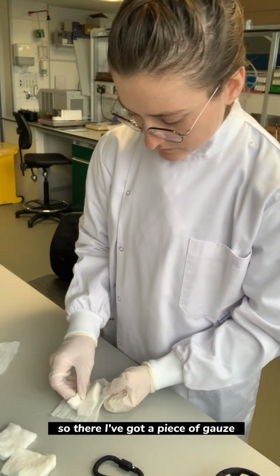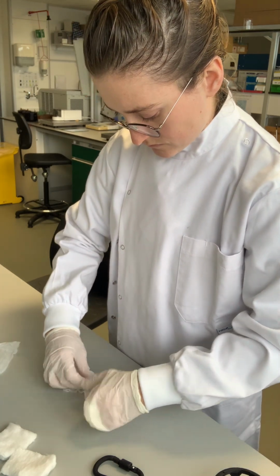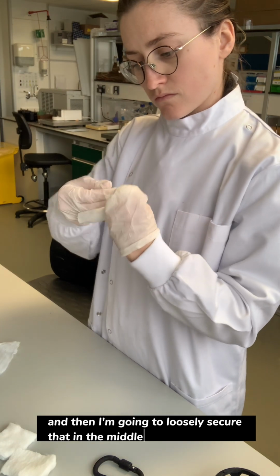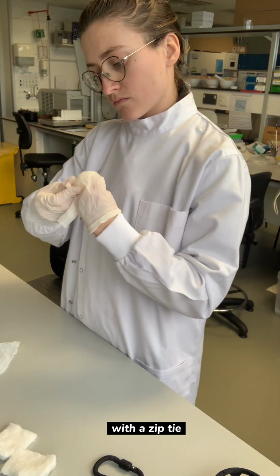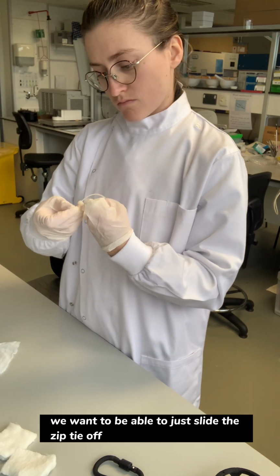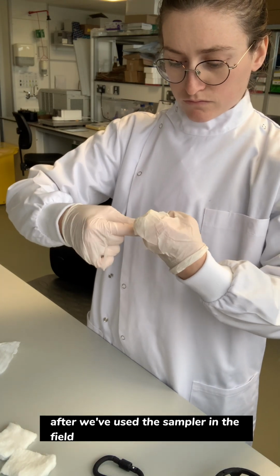So there I've got a piece of gauze, I put the cotton inside, and I roll it round, not too tightly, but tight enough that it kind of holds together. And then I'm going to loosely secure that in the middle with a zip tie. Loose is really important here because we want to be able to just slide the zip tie off after we've used the sampler in the field.